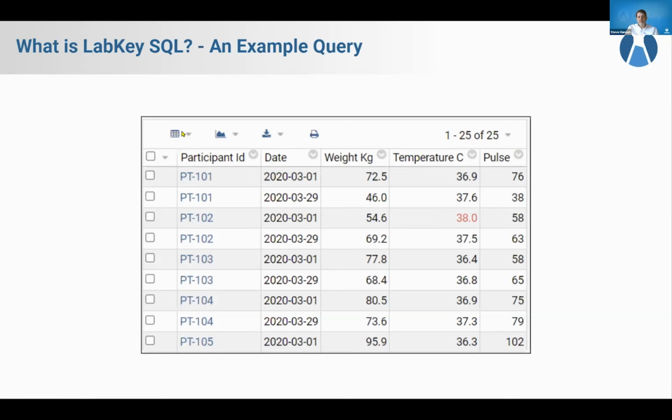And then there are also all the tools up here. These are like the tool buttons of any LabKey data grid. You can use the graphical interface to customize the grid. You can use the graphical interface to build reports on top of this grid, et cetera, et cetera.